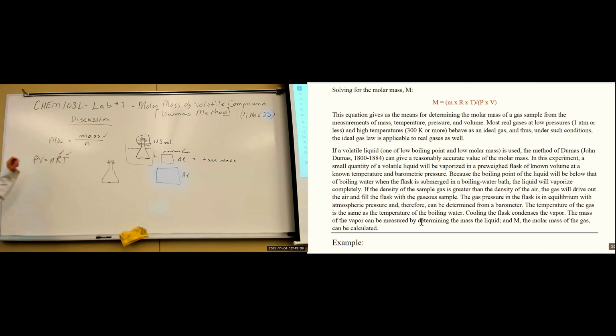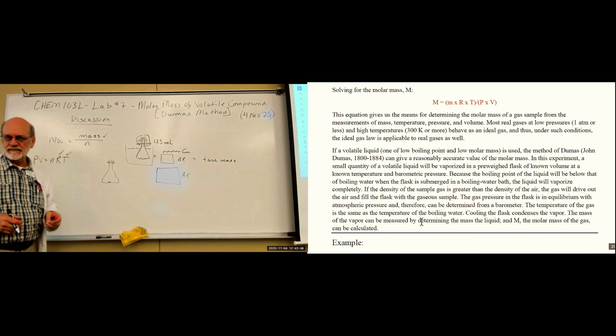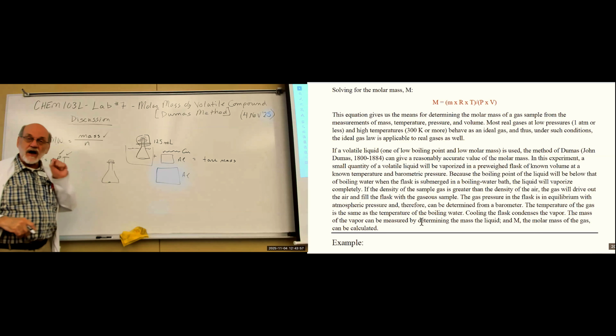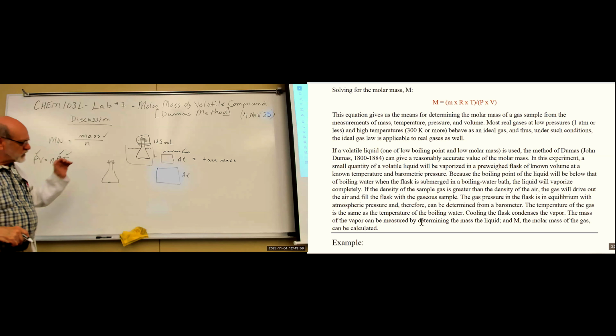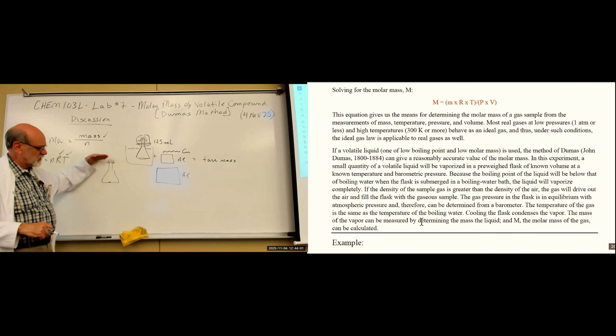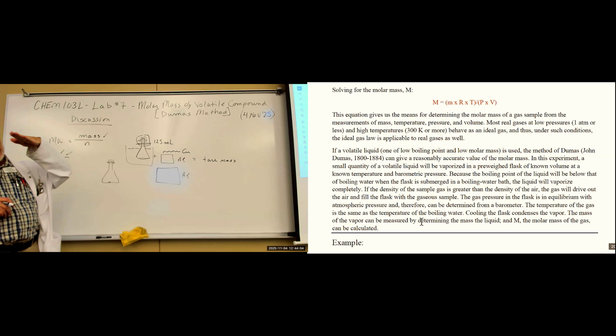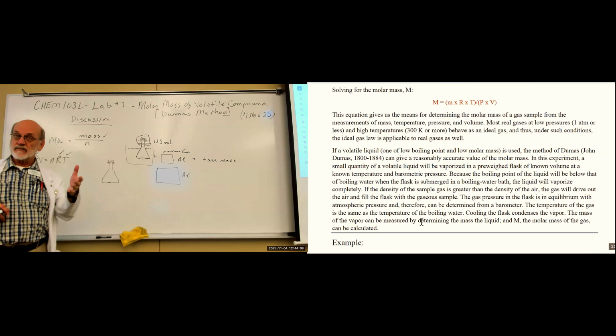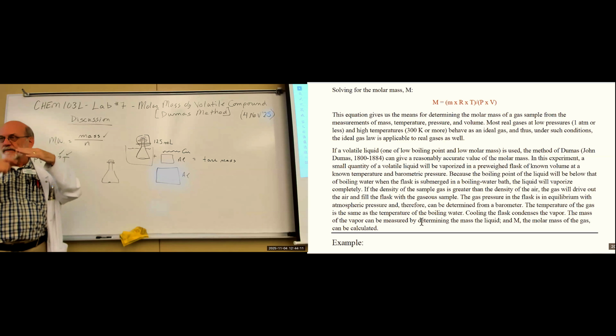How about the pressure? What's the pressure on that gas? Well, we don't know. I have to read it off the barometer in my phone. So that's barometric pressure. How about the volume? How do we determine the volume that the gas occupied? When you put that small piece down here on the top, you want to try to keep it as level as possible so that when you determine the volume later, you know where to stop.